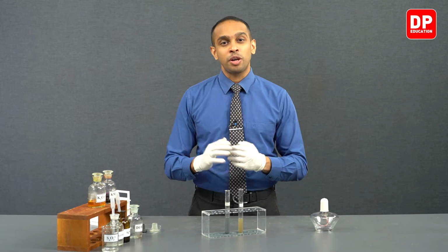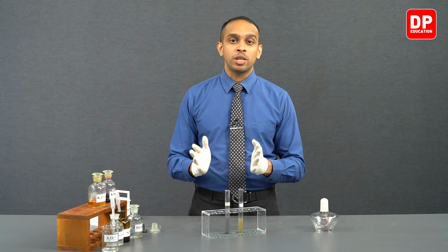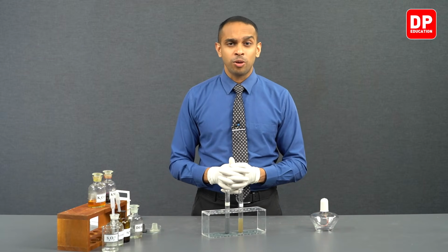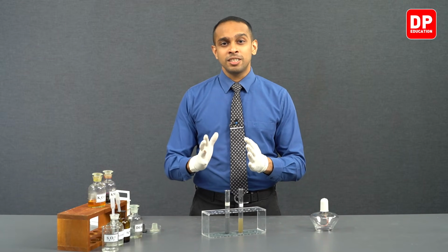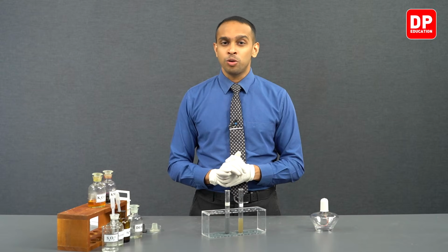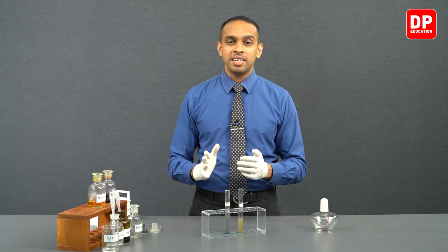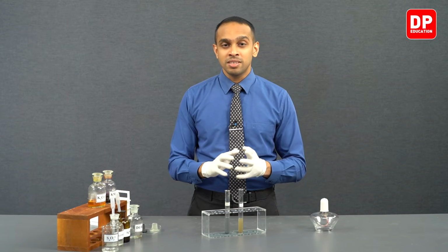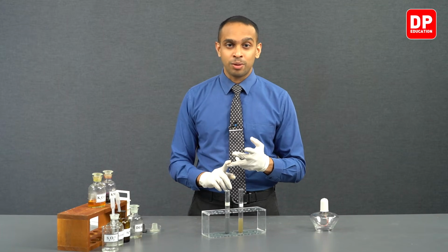Solid sulfur is going to be produced in the form of colloidal sulfur. So the solid sulfur that is produced is going to be observed as a yellowish white precipitate. So we knew when we added hydrochloric acid to thiosulfate ion solution, sulfur is getting produced. Apart from that, we had to test for the presence of sulfur dioxide. So when we added hydrochloric acid to thiosulfate ion solution, sulfur and sulfur dioxide both were produced.